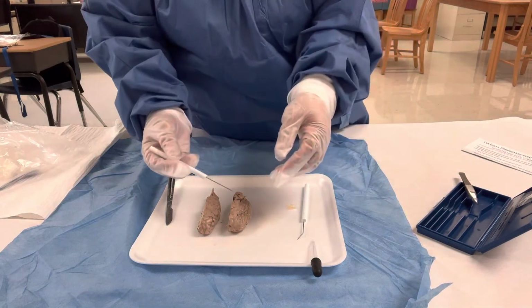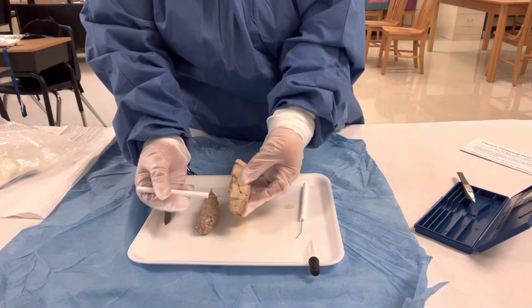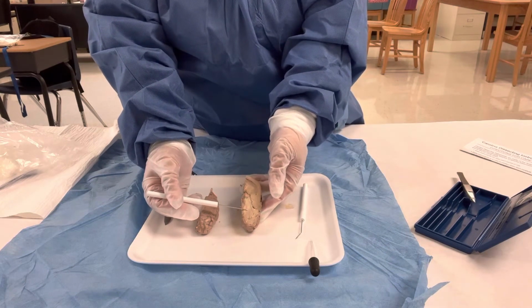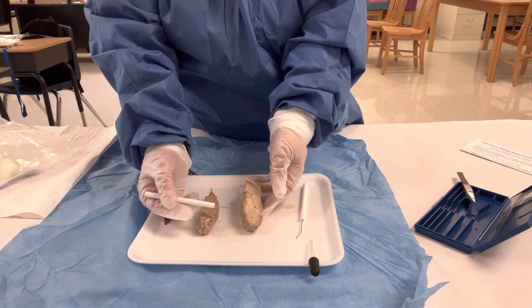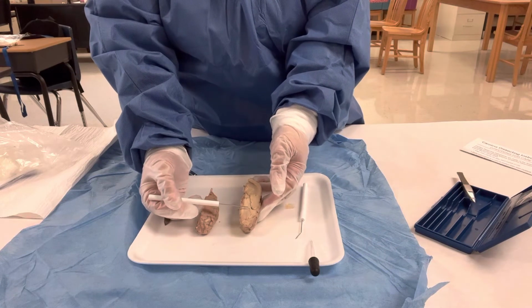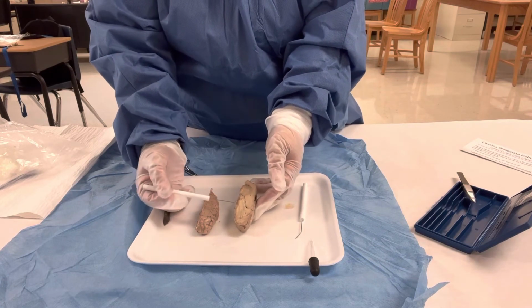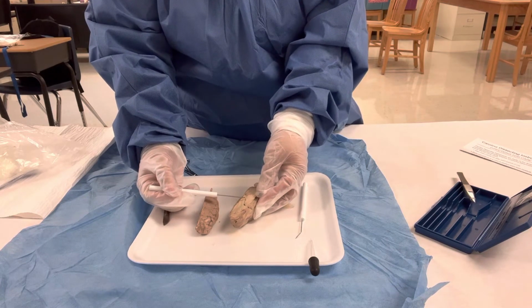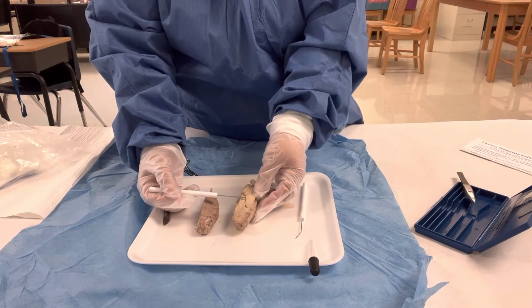Let's see. Here you have the corpus callosum, a large band of nerve tissue that connects the two cerebral hemispheres. It's right here. The thalamus would be this portion here.